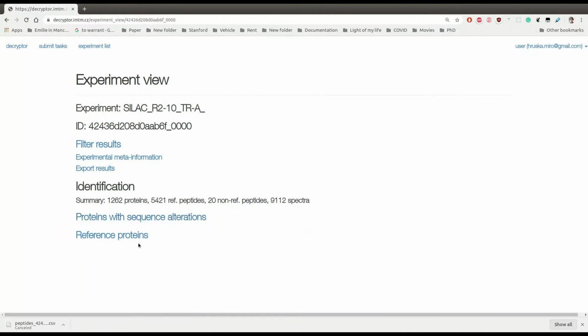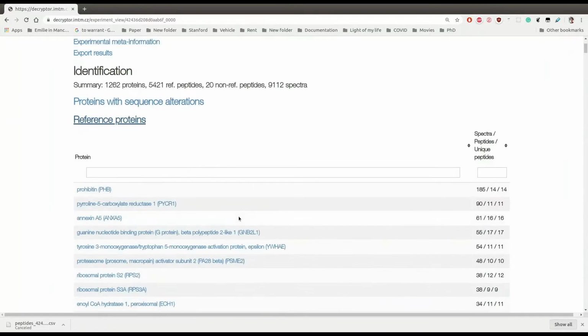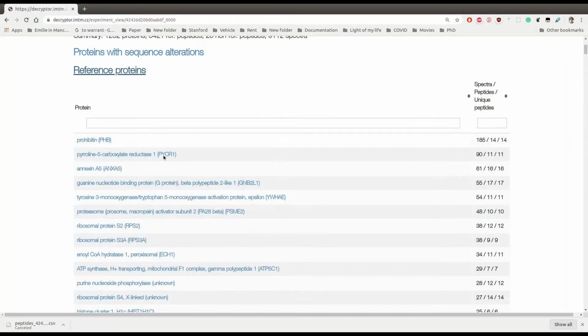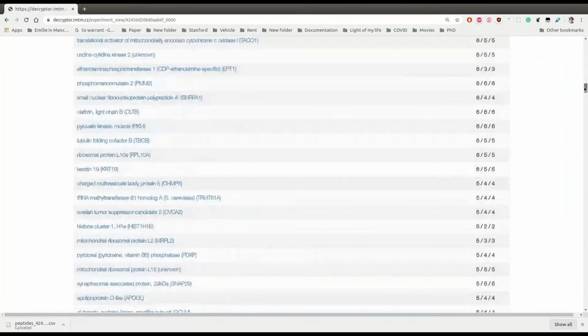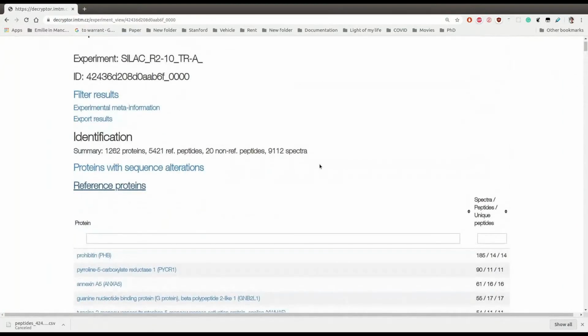In a typical proteomics analysis, you will basically get this lower part: what proteins are detected and what their quantity is, and based on that, you could then do the analysis of protein expression if you have such a report for multiple biological conditions.